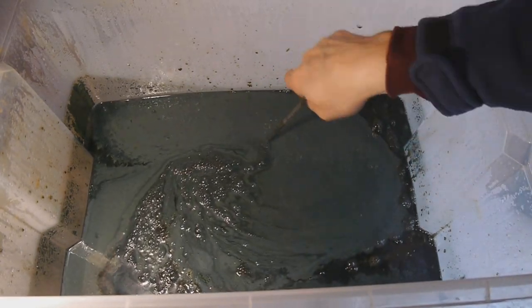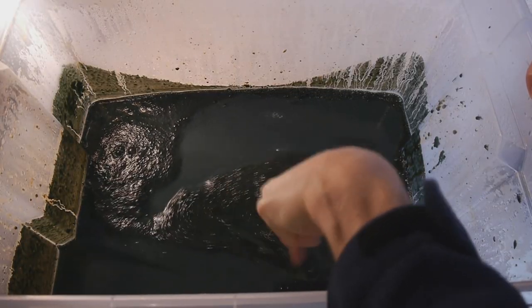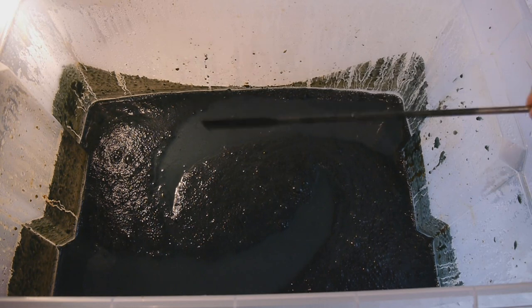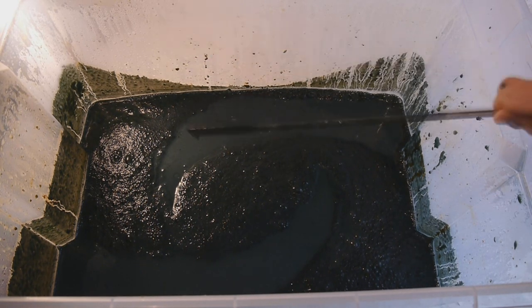Well, at least something's happening. Alright, now I feel somewhat confident that this is decently mixed, so let's measure the pH again.